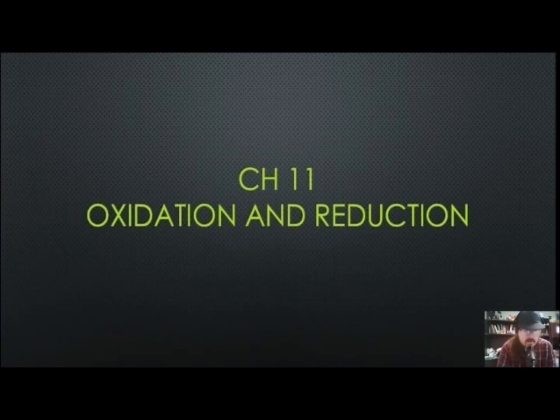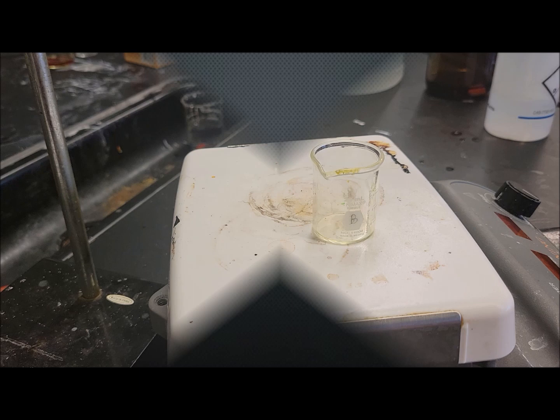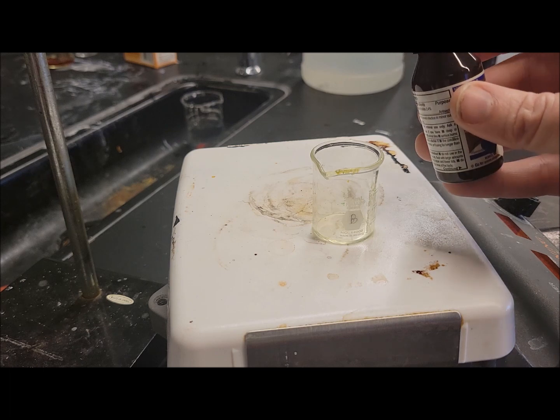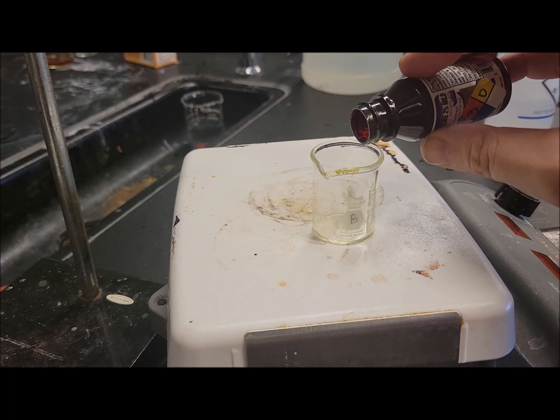Welcome, everyone. We're going to start Chapter 11, which is Oxidation and Reduction. We'll start this with a quick demonstration of oxidation and reduction using zinc, an iodine tincture, and some bleach. For this demo, I'm going to attempt to reduce a little bit of tincture of iodine with some zinc.